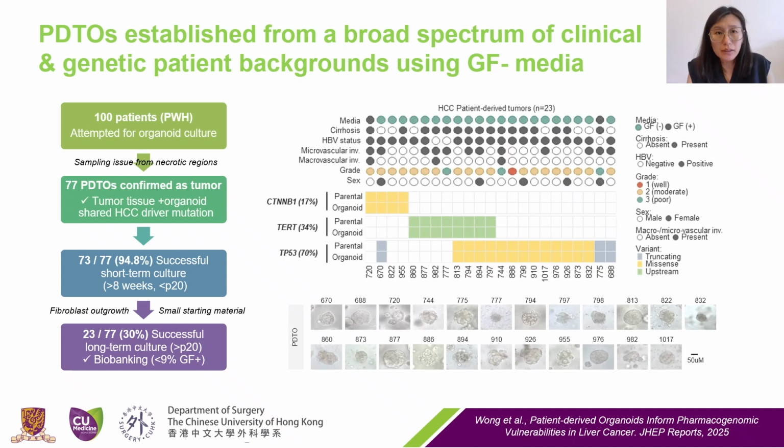This is a summary of the patient-derived tumor organoids that we've successfully established from a broad spectrum of clinical and genetic patient backgrounds. We can see that nearly all of them could be established using growth factor reduced media.